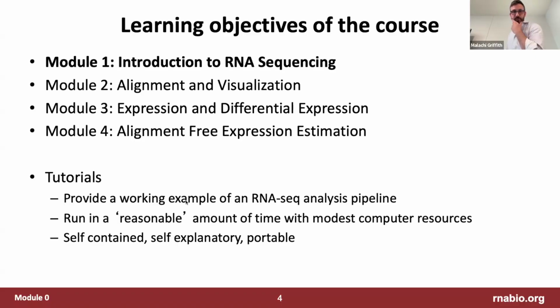Okay, so here's an overview of the course. At a high level, we're going to work our way through RNA sequencing. Where does the data come from? Then we're going to work through alignment and visualization techniques for that data. Then we're going to calculate expression of genes and do differential expression analysis and pathway analysis and comparisons between different methods of differential expression analysis, batch correction, those kinds of things. And then hopefully we'll have time to do alignment-free expression estimation, which repeats the whole workflow from a different starting point, where you're assuming you don't have a reference genome. It uses different tools, but it's conceptually the same idea of what you've worked through.